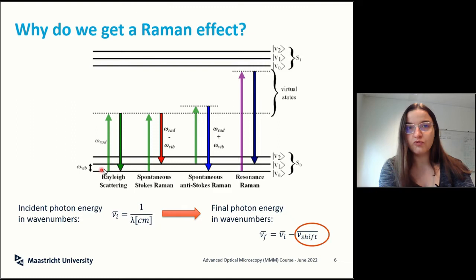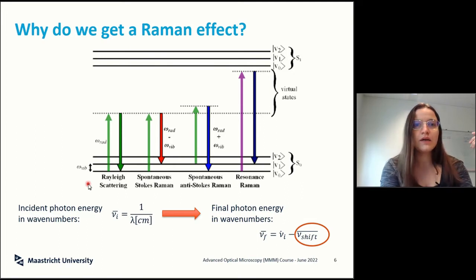And how do we actually report this thing? So this thing always comes with this sort of shift. So you know what you put in. You want to know what you are collecting on the outside. So you could convert the energy of the photon that you're putting in into wave number, so scale it with the speed of light, fundamentally.